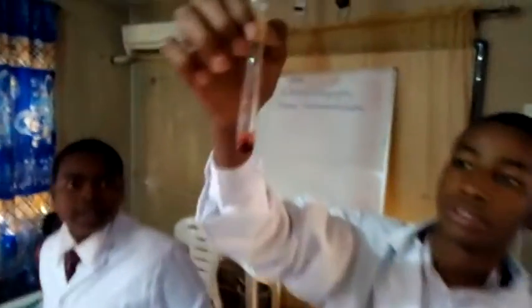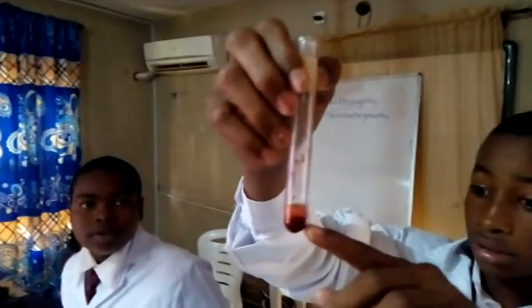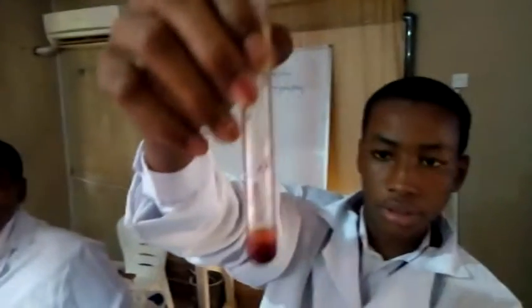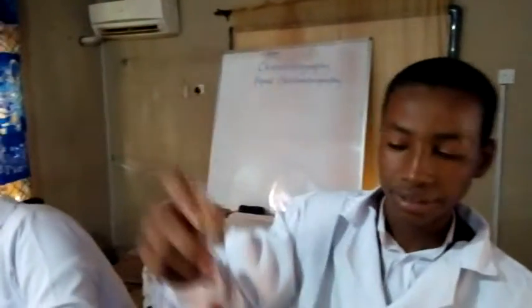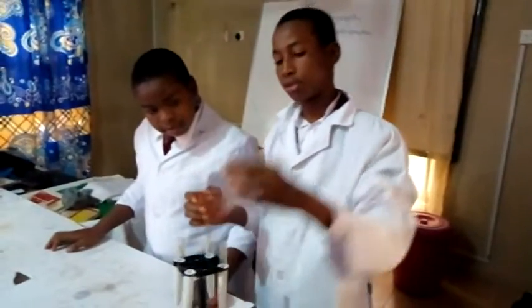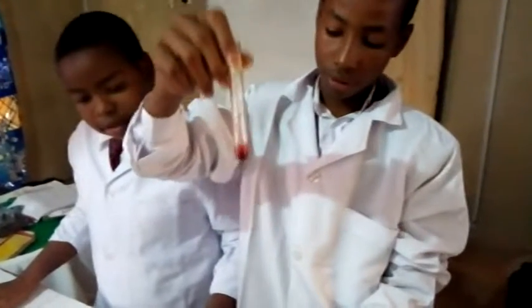The blood sample, you can see, was separated. This is the sample that is at the bottom. You see? After 3 minutes of centrifuging, this is what we obtain. This is the blood sample separated out. What you are seeing now.